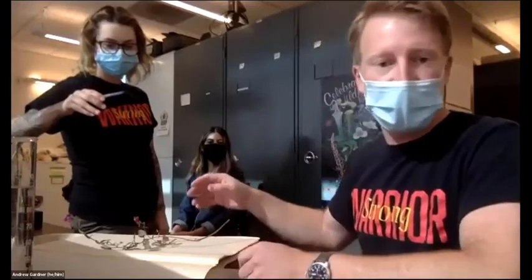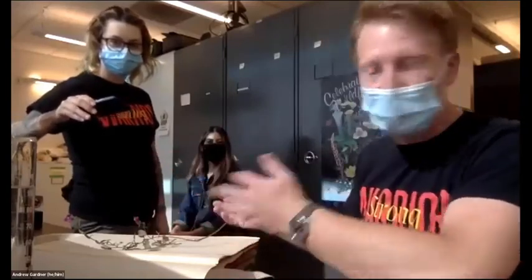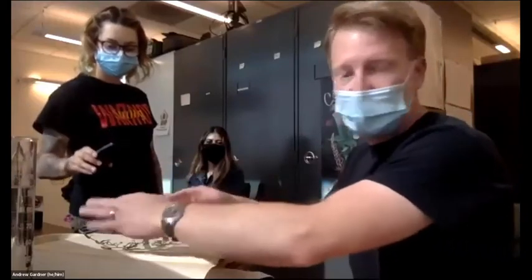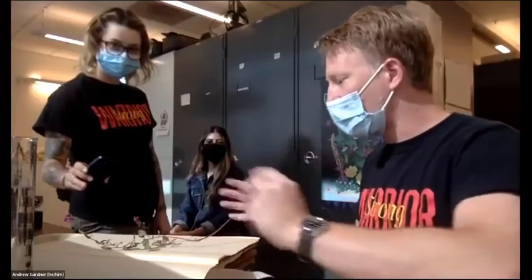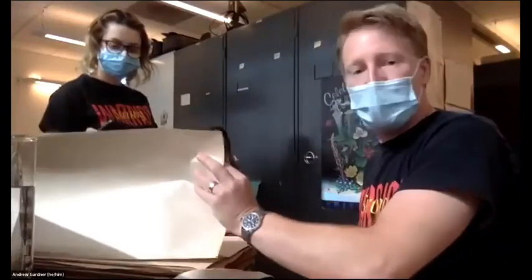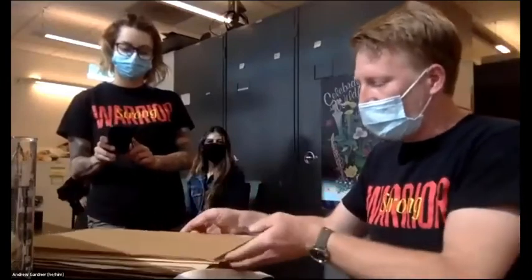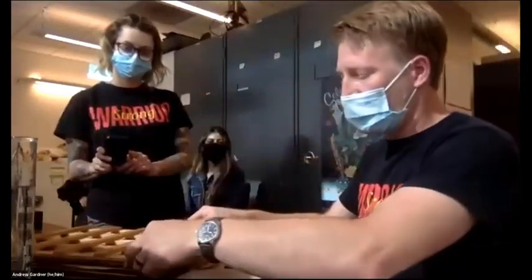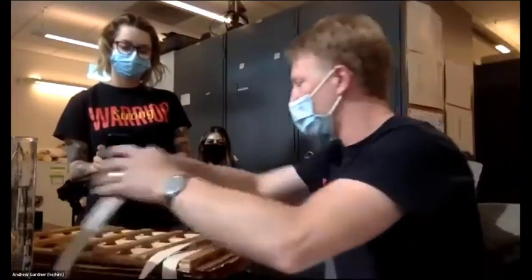And you want to think about how it's laid out, because this is going to be its permanent form. So I want to make sure, for instance, that the flowers are not all smashed up on top of each other. They're spread out. That's good. And then what I can do is take the piece of paper over it and then put a piece of cardboard, wood, and straps.